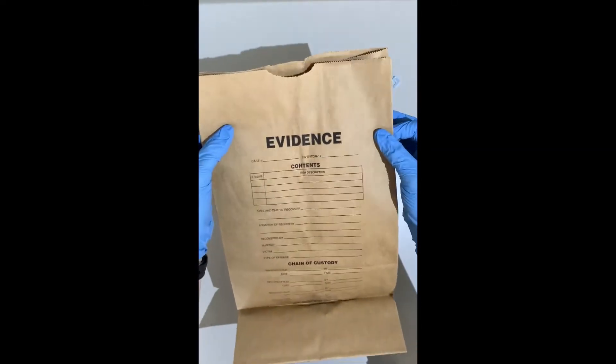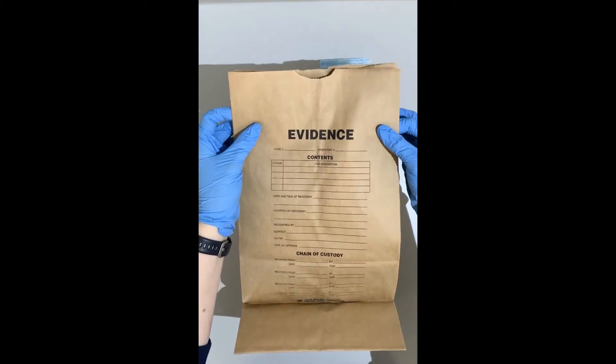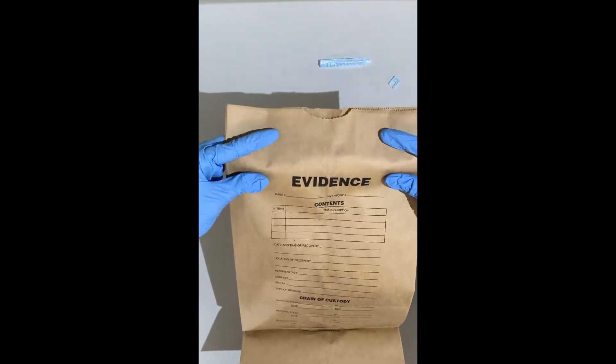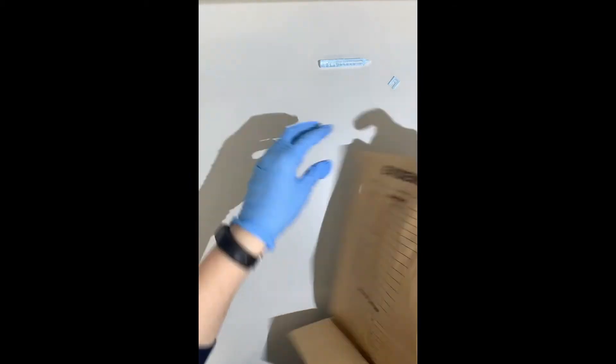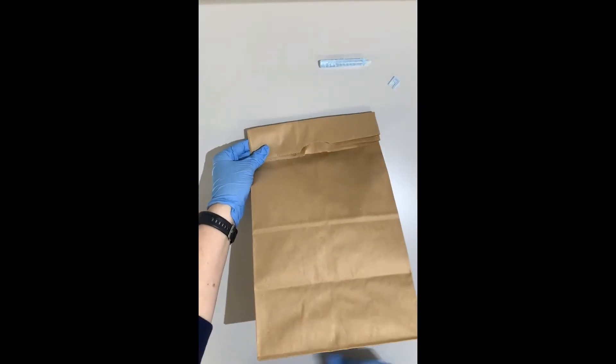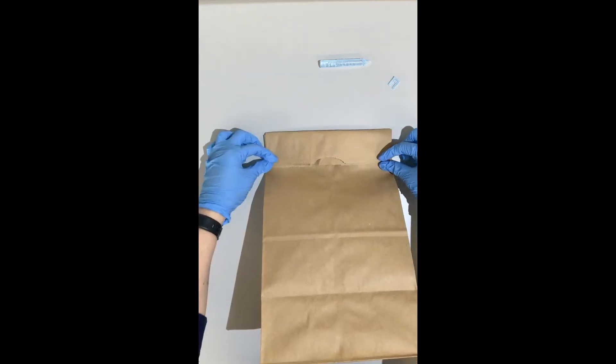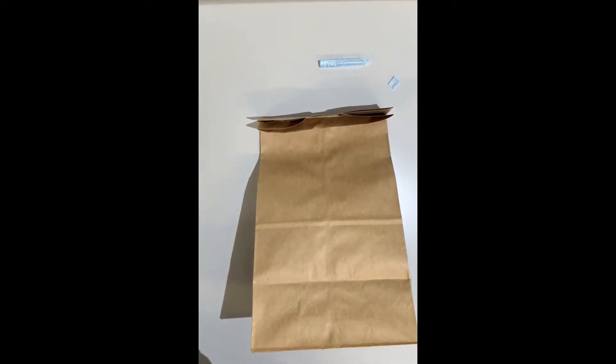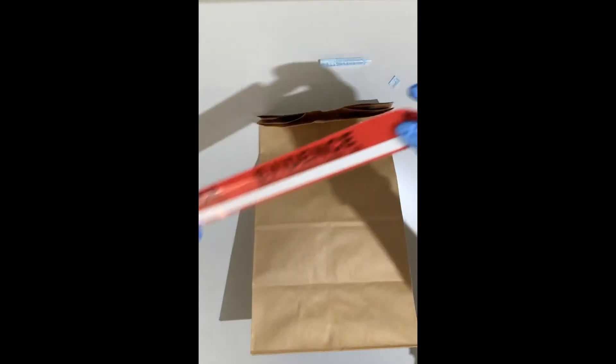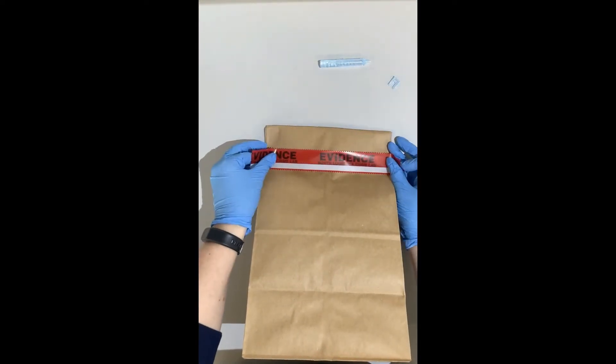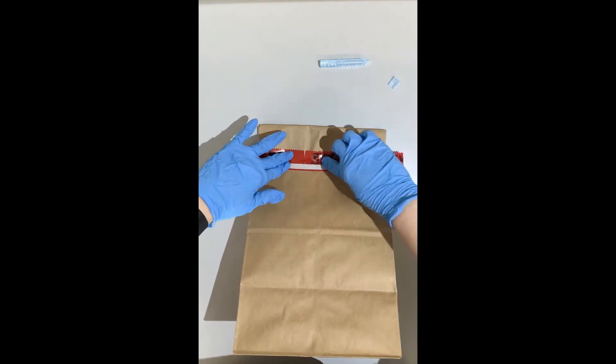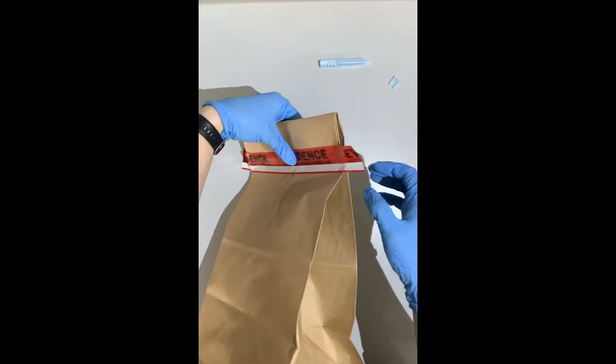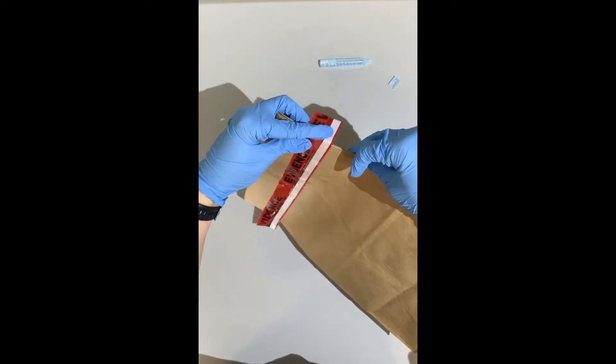Make sure that you have labeled the front appropriately and then you want to fold over the top and then we'll seal across this back line. You'll take evidence tape in the appropriate length, place it over the edges so that the seal is on the top and bottom portion and then wrap it around.